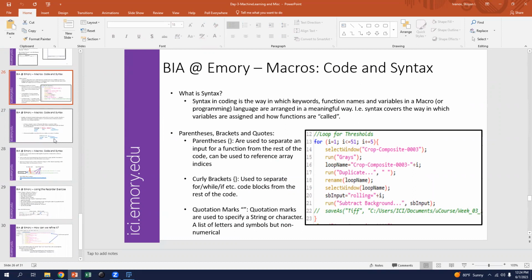We'll end a little early today. So in terms of programming a macro effectively and writing it, I am a physicist. That's what I learned when I was in school. That's how I was trained. And physicists have a very bad tendency to name all their variables A, B, C, X, Y, D. And that is simple as you do it, but it can become very hard to later on go through that code and interpret it. Interpret what it's doing, why it's doing it, and how it's doing it.